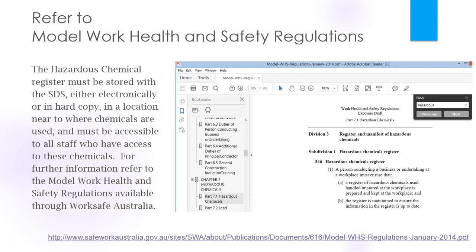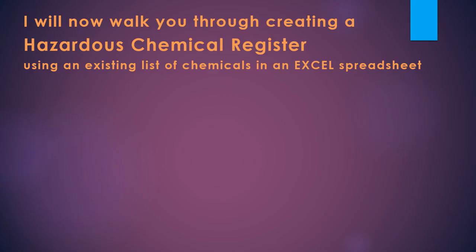Our workplace stores the hazardous chemical register in a filing cabinet and that's located in an area accessible to staff and students along with a full copy of each chemical SDS arranged in alphabetical order. A duplicate of all this information is kept in the school administration building in ring binders instead of a filing cabinet.